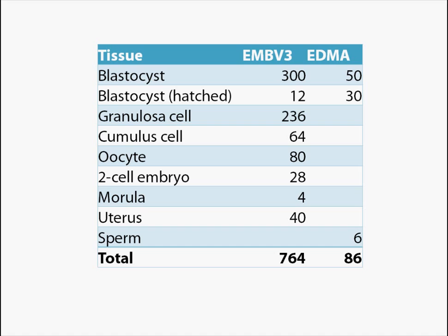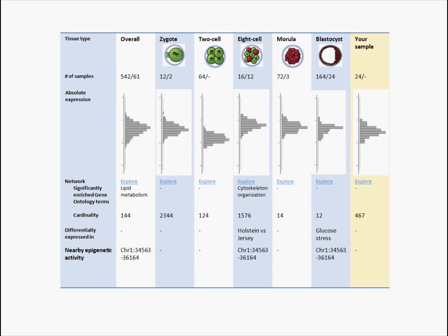Up to now, 40 projects have been carried out using the EmbryoGENE platforms, leading to 11 published papers and a database of over 850 microarrays. Now that both platforms are ready for wide usage, our next challenges will be to make the data within this database available to the public. To this end, we are currently building search functions into the database and have started prototyping meta-analysis features.